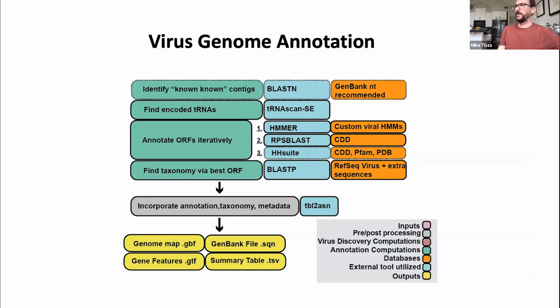Okay, I think I have a little time. So yeah, I do want to talk about virus genome annotation. I'll quickly go through how it works with Cenote-Taker2, and I think I'll show a couple of examples of how that can be useful for someone who wants to use it.